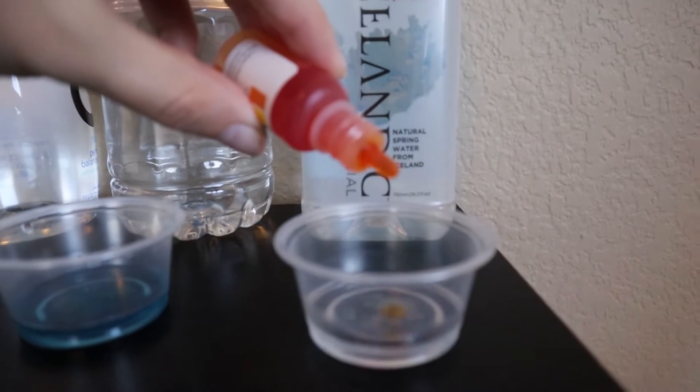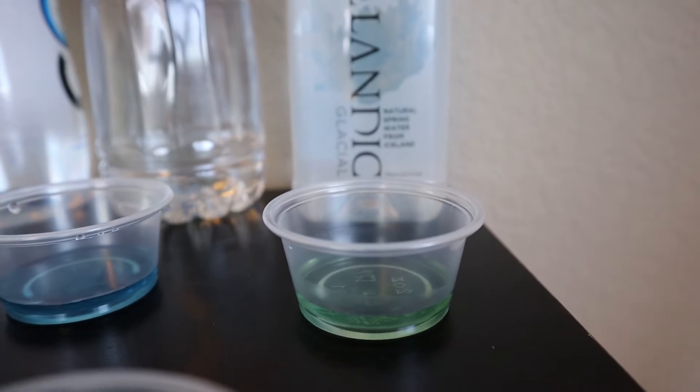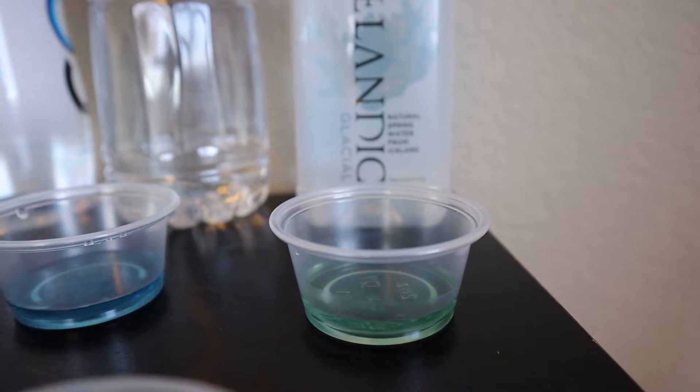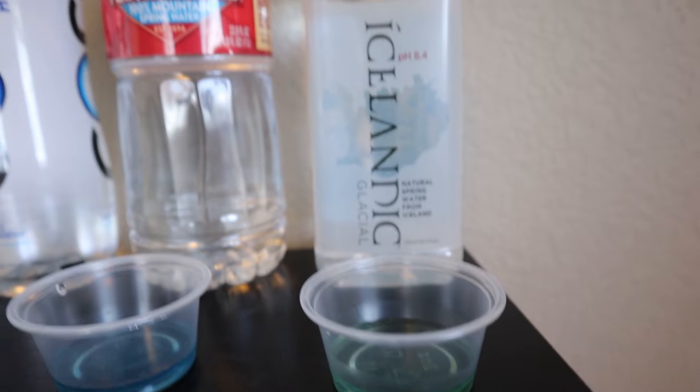And then next we have Icelandic. It's a spring water coming from Iceland — it's actually created by a volcanic eruption that caused an underground spring with its own natural filtration. We get 7.5 to 8.